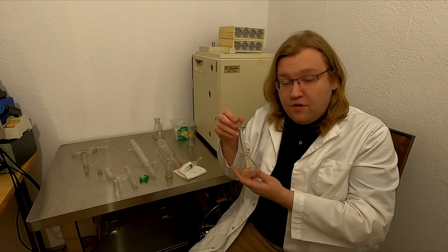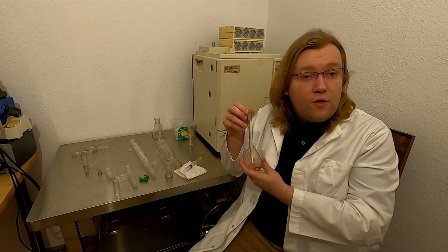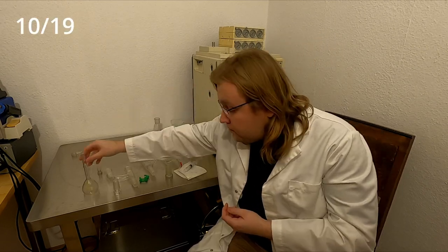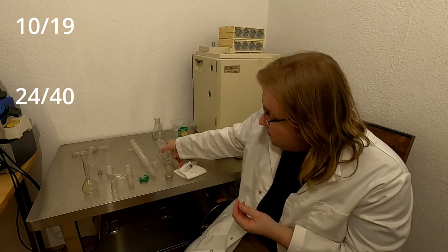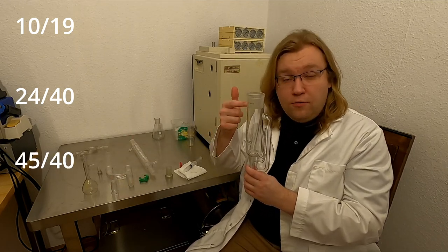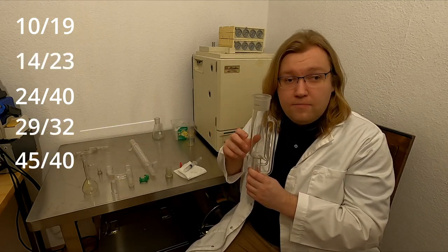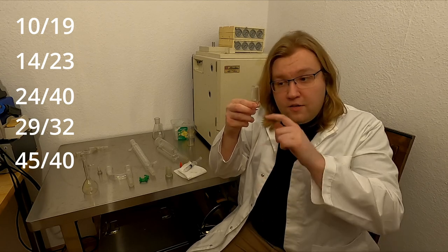They come in a variety of sizes, from the small one used in the volumetric flask, to more normal sized ones used in everyday lab equipment, to very large ones as used on top of the Soxhlet extractor.